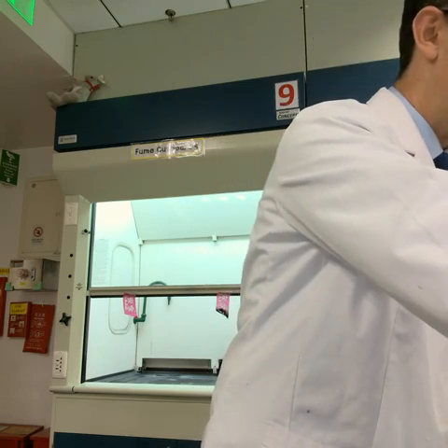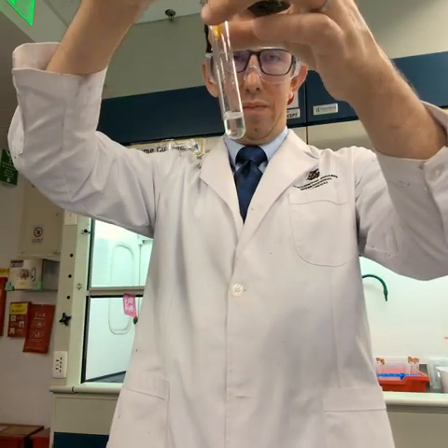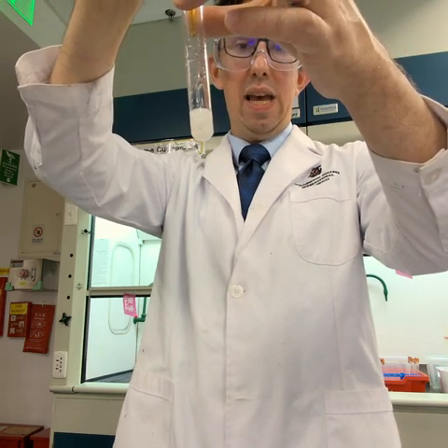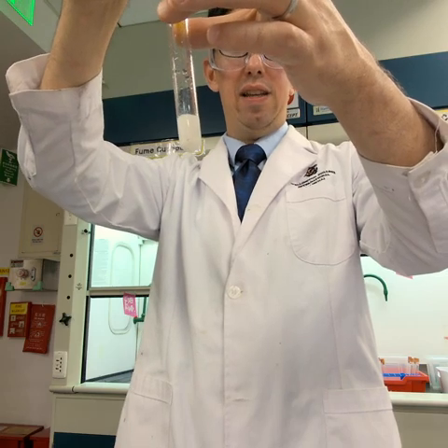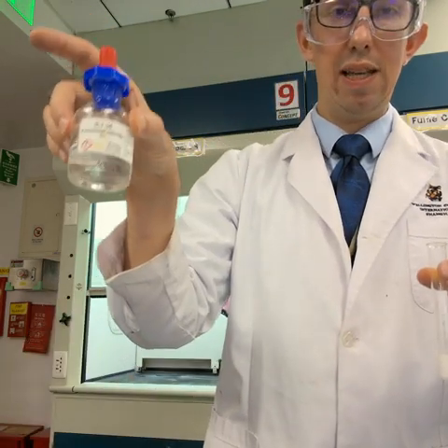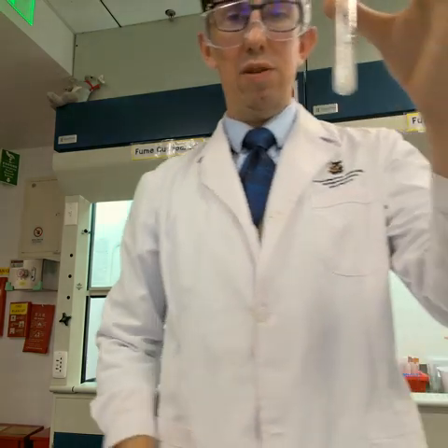And now I'm going to take the second test reagent, which is silver nitrate. So we're going to add silver nitrate now. And can you see there is a white solid appearing, a precipitate. So we can see a precipitate appearing, and it is white. Now if it's white, it tells me that this must have contained chloride ions. And there we go, we can see that this was potassium chloride. So that was the test for chloride.